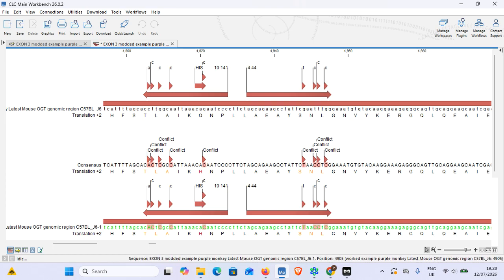And from my previous videos, hopefully you'll recognize the orange amino acids denote that the code has changed, but the product remains the same. So our guide RNA disabling at these three amino acids and at these three, which happen to spell Saturday Night Live, have also been changed. And we also have our loving single histidine introduced in this location.